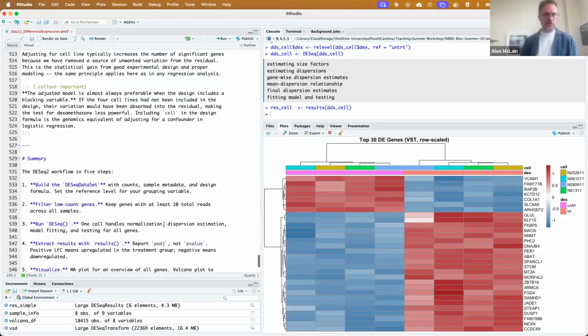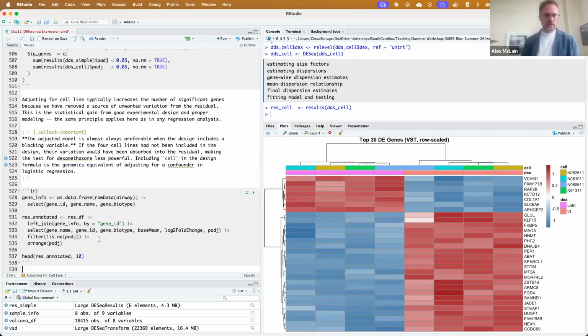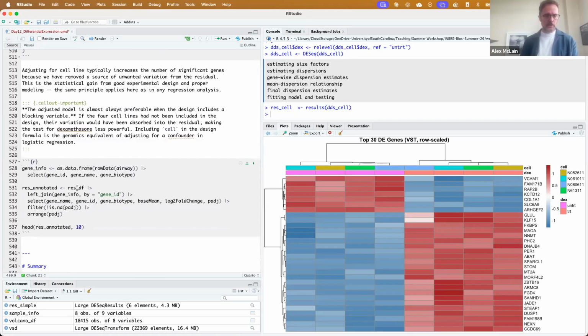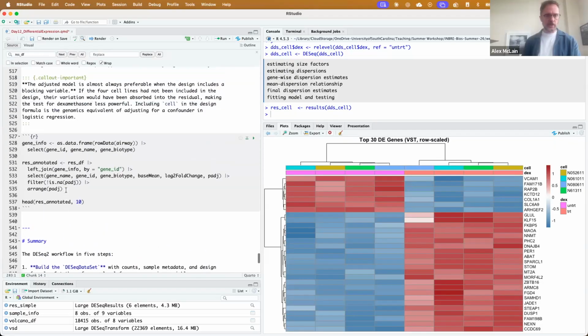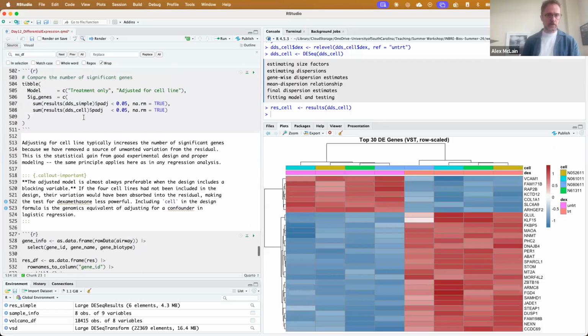Okay, I'm going to copy those down here. Still using the airway data. Nothing changes from that. We're just going to get the results for cell here. And what we used initially was the results DF. So let's see where that was defined. All right, okay, that was defined right here. So I'm going to define that first. Give it a slightly different name from what we had before.